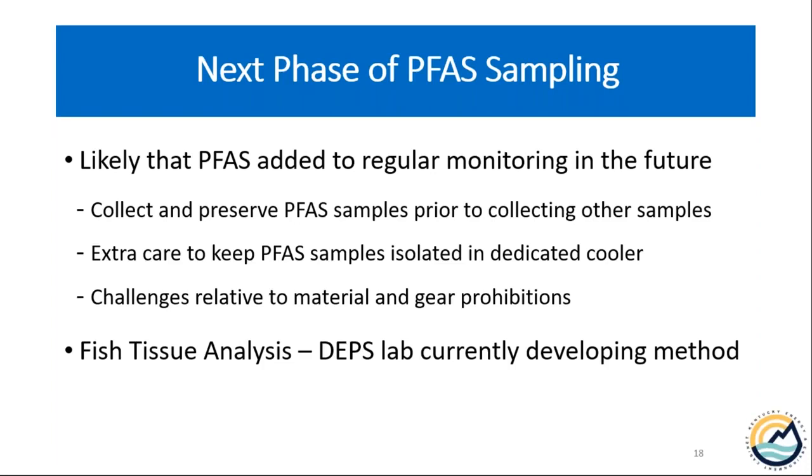For our potential next phases of PFAS sampling, I think it's fairly likely that we will see PFAS added into our regular monitoring in the near future. When we do this, it won't be every site, every time, but we will collect and preserve those PFAS samples prior to collecting any other samples, make sure that they end up in their own dedicated cooler and that no other sample types are in there with them. Of course, this is going to present some challenges relative to material and gear that we have to have with us for our other field work that has been prohibited because it contains PFAS.